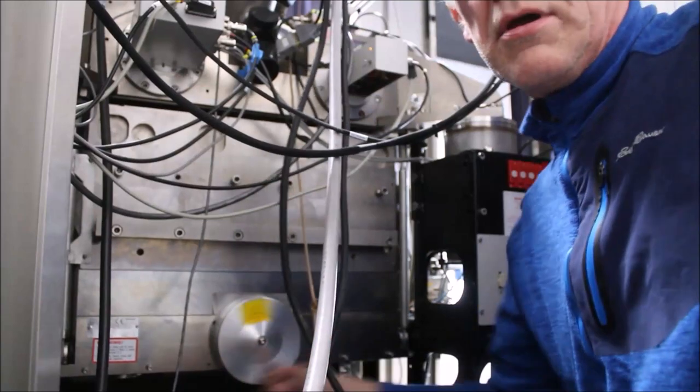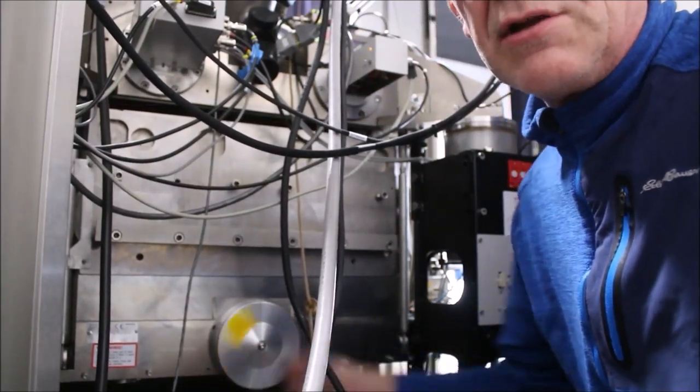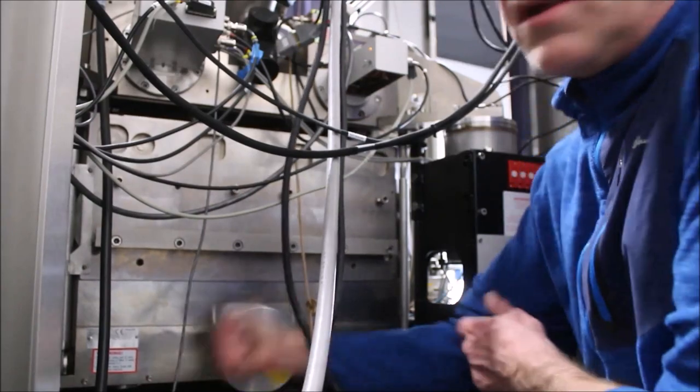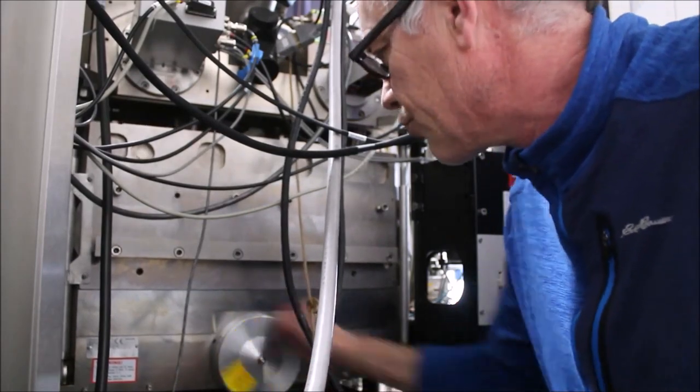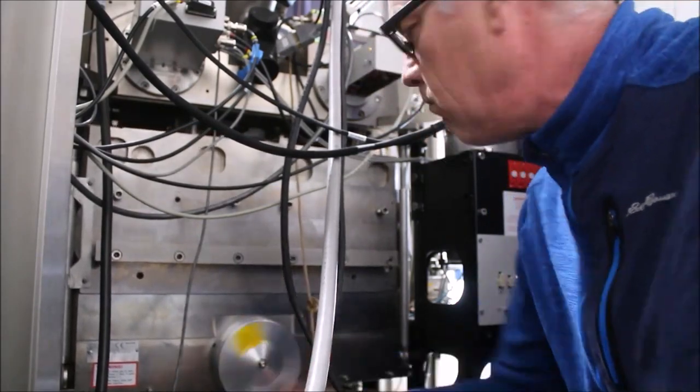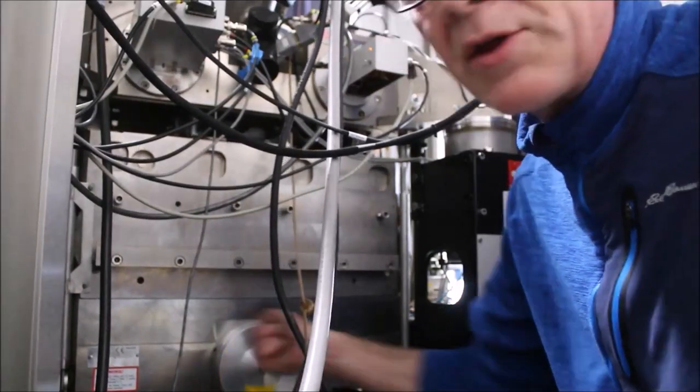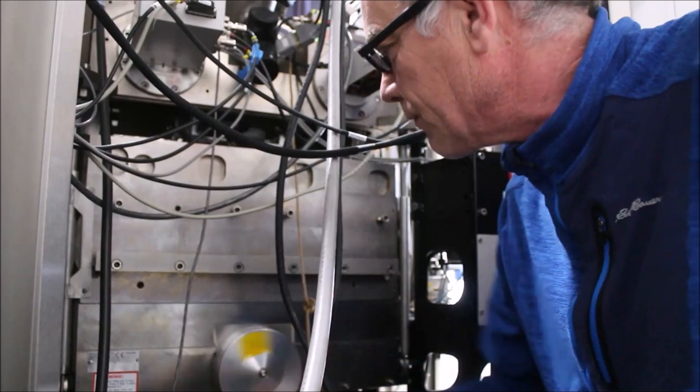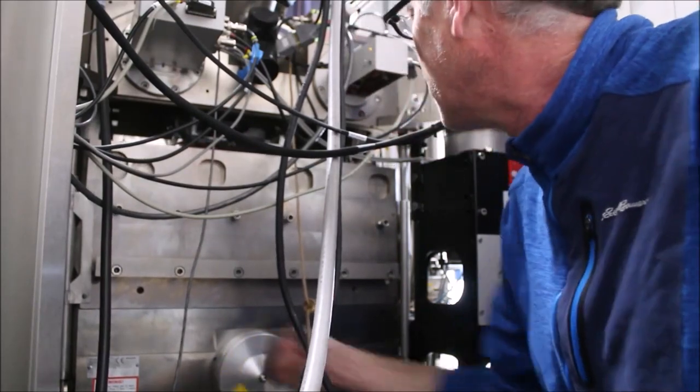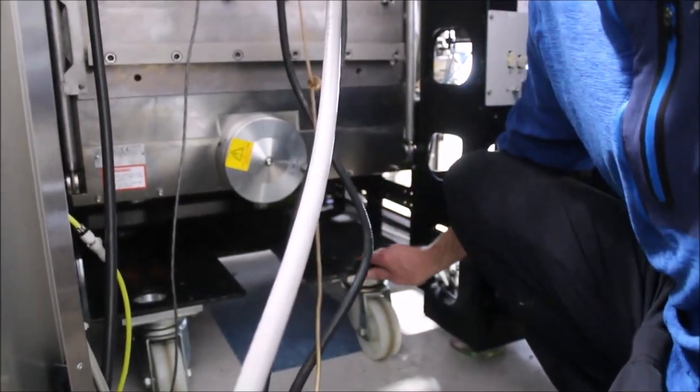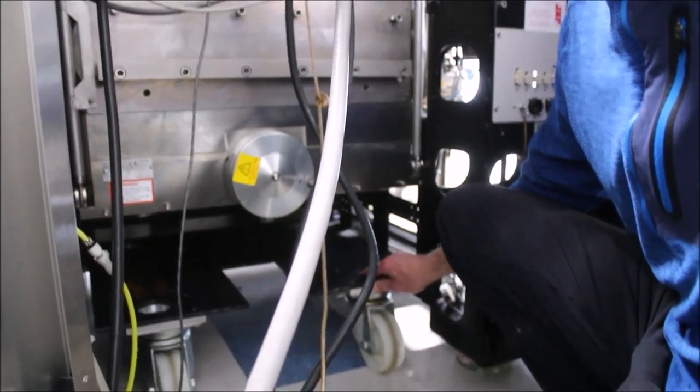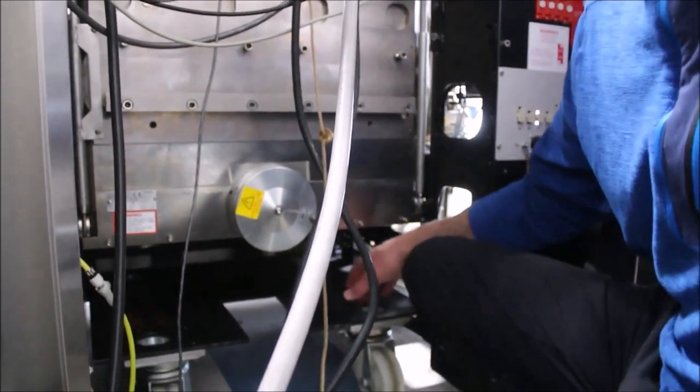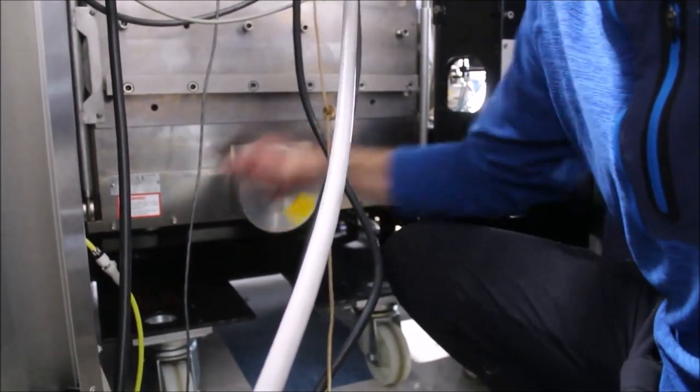We're going to start by bringing the sump down by turning this handle. Everything should move smoothly. If it feels like it's binding or giving you trouble, there might be a problem with the cables and that'd be a different service issue. Let's lower it down onto this little cart with wheels so we can pull the sump out and access the stage.